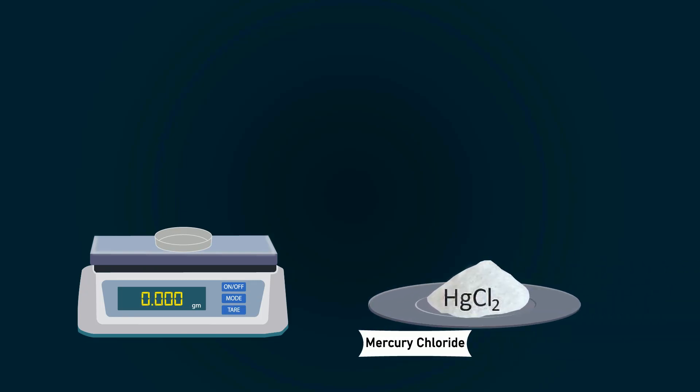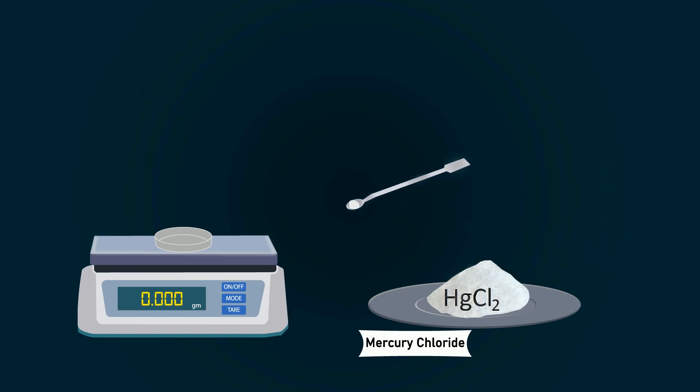Now take mercury chloride chemical. You can put this chemical into the petri dish with the help of spatula. Weigh precisely 2 grams.